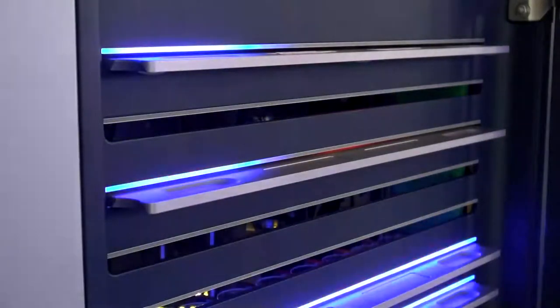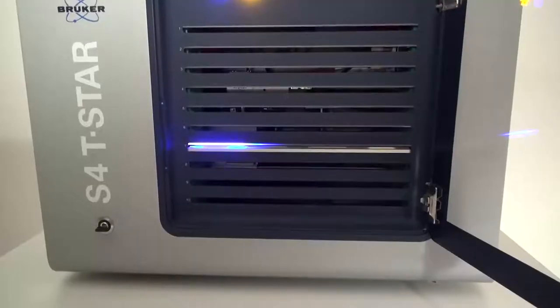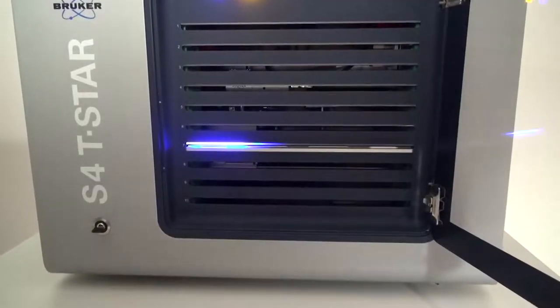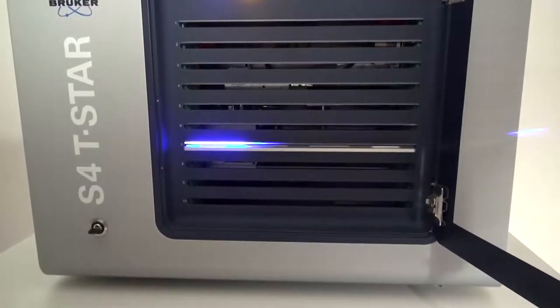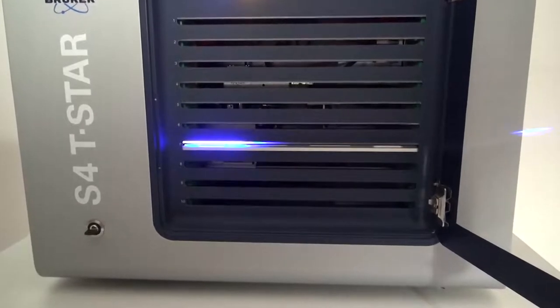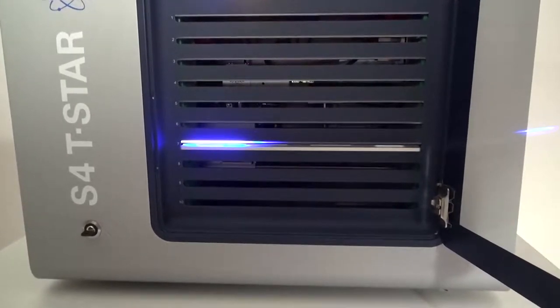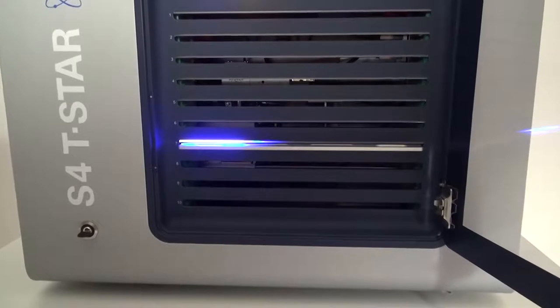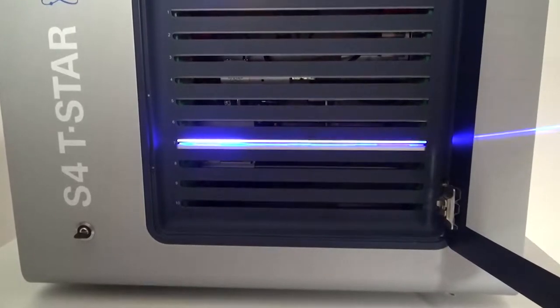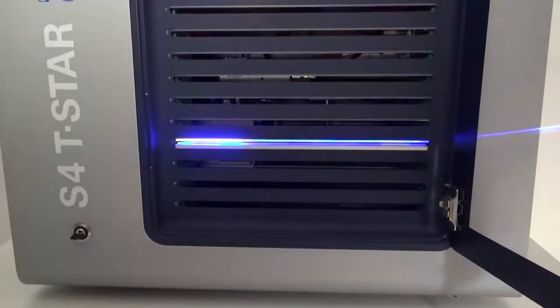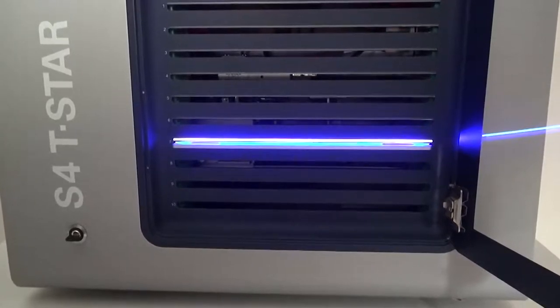Type and position of each tray is automatically detected and shown by a flashing blue LED light at the left side of the front panel. These LEDs also indicate the status of the measurements. Right side LEDs flashing means sharp running. Entire LED line constantly shining means sharp finished, the tray can be removed.